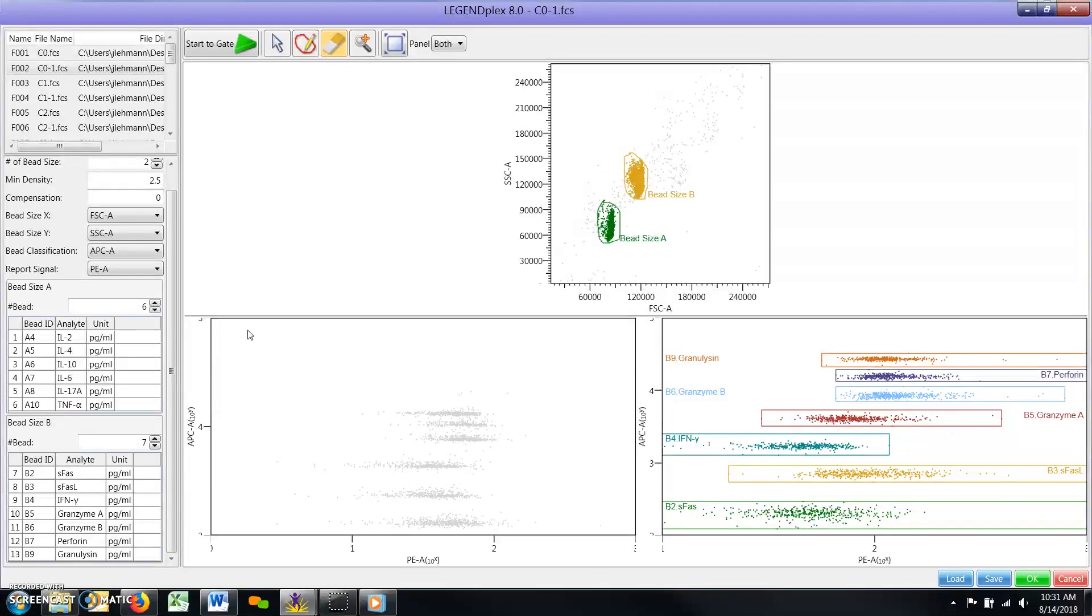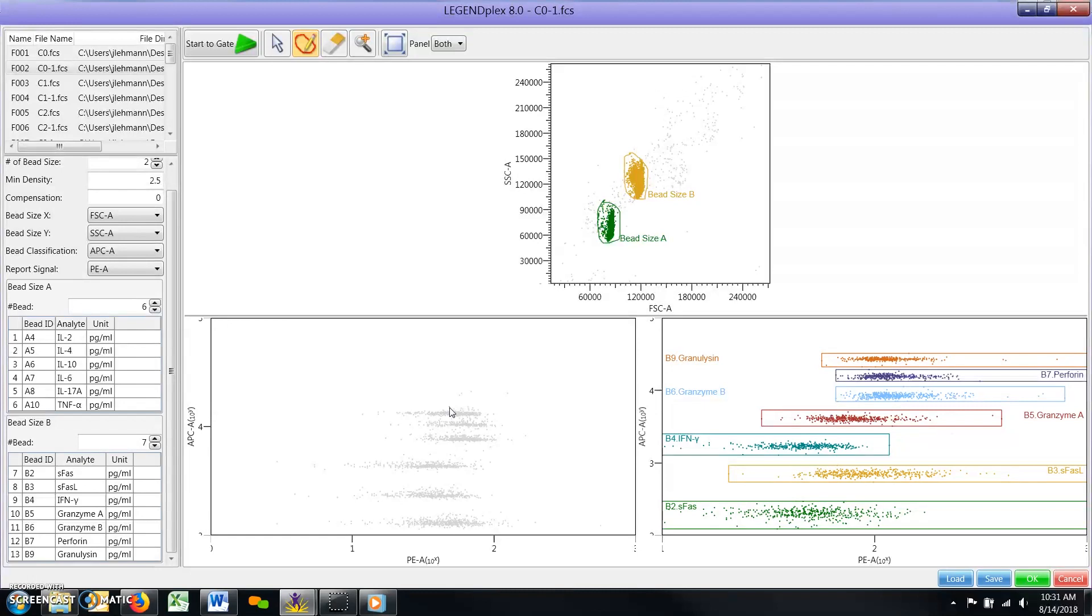Next, select the drawing tool to draw a new gate by holding down the left mouse button and dragging the gate to an appropriate size.